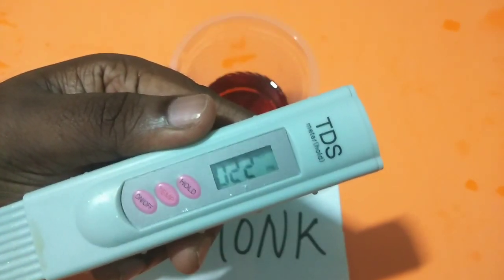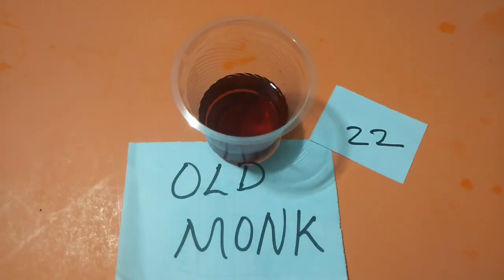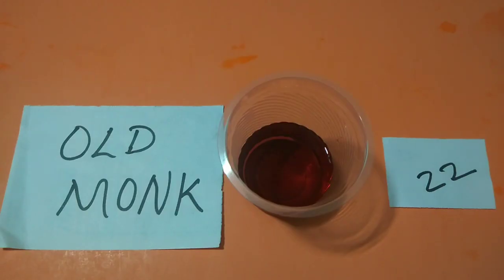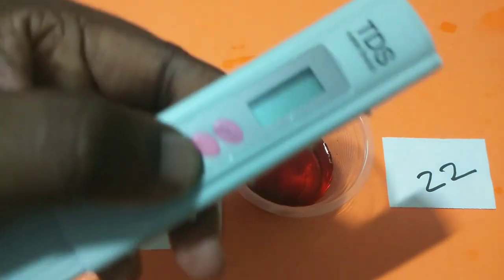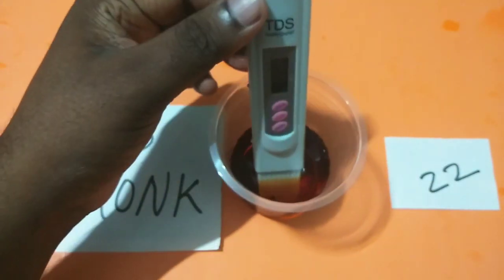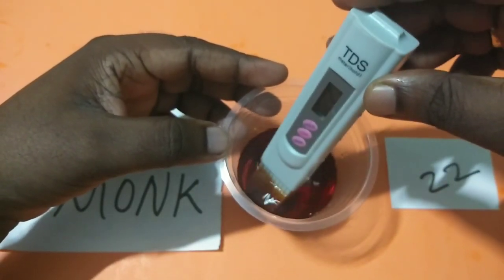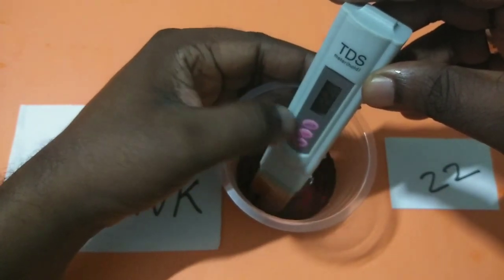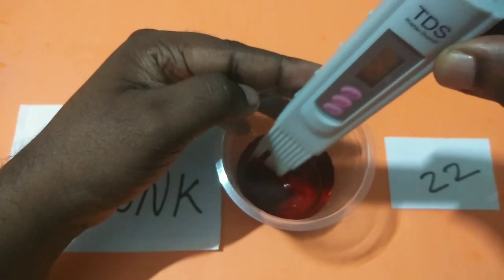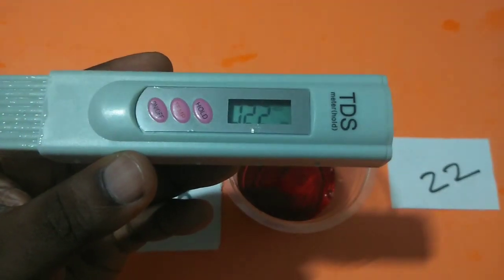You can see it's showing 22. So let me measure the TDS one more time. Switch off and switch on the meter, then press on hold button. Then you can check the reading — yes, it's showing 22.